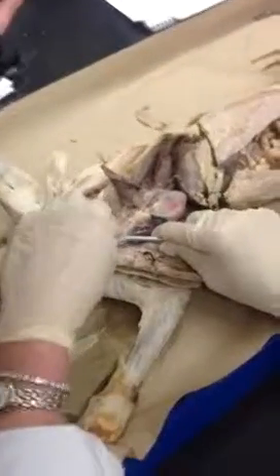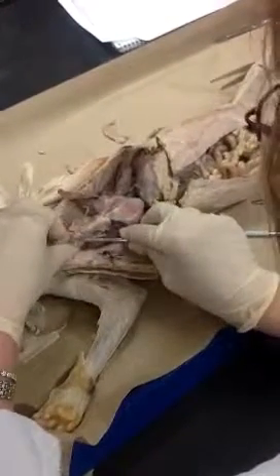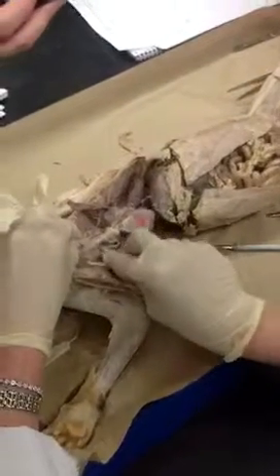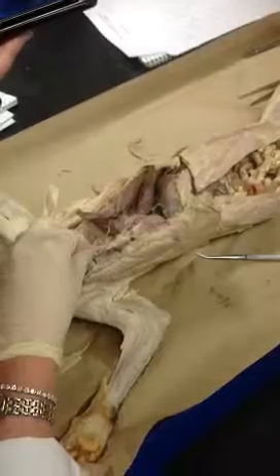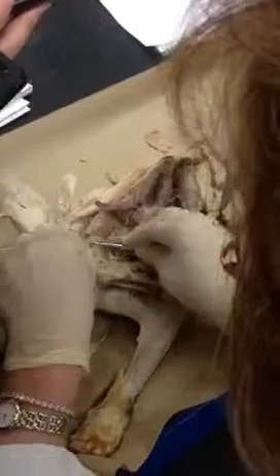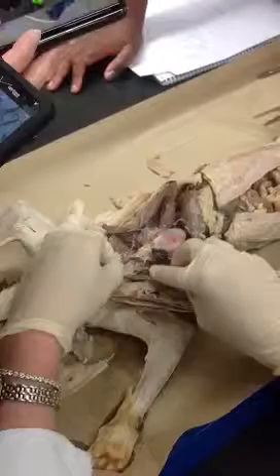So you see it branches really, I mean, these are almost like they look plastic. They're just perfect, which is kind of amazing, really. But you've got those 2 right here. Then if you come right behind here, and again, you can kind of clean out this connective tissue as you go along. You can see this starts to branch again. And we're going to come right through here. There's your right common carotid. There's your right subclavian. So we're following the right subclavian, and we've got this huge vein right on top of it. We don't want to tear that vein out because we're going to need it here in a minute. So you need to just kind of loosen it like I did there, and then you can pull it out of the way. The arteries are a little bit deeper.